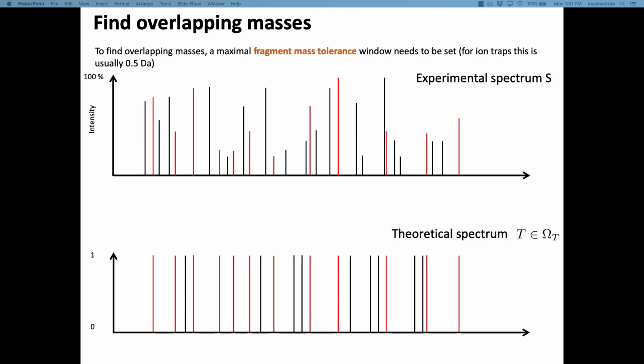So we got a mass spectrum, and the way you did it, you took the 3 most intense peaks, and then you went to the library. And there were books with indices, and you could just say, I saw a peak at 74, at 53, and 120. And then that would link you to the books in the shelf where the spectra were printed. What was the idea?